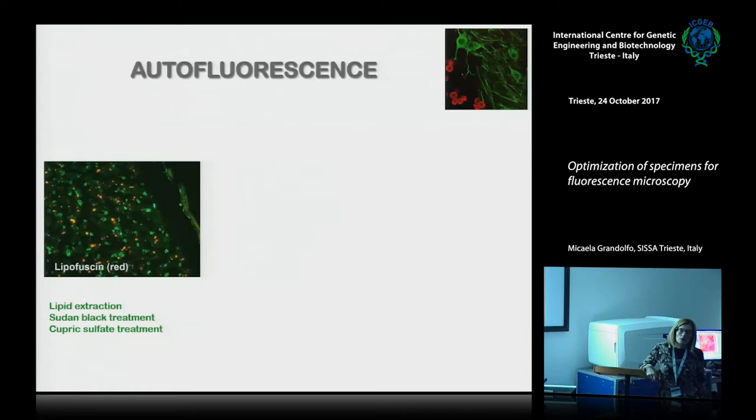It is better to use green when I use GFP, for application purposes. Okay, very often when you have GFP and you have a very high level of background fluorescence, you are not able to acquire a good image from that sample, just to have a nice green from your GFP protein. But you have to perform an immunostaining using some antibodies against your GFP protein, just to increase and amplify the signal.